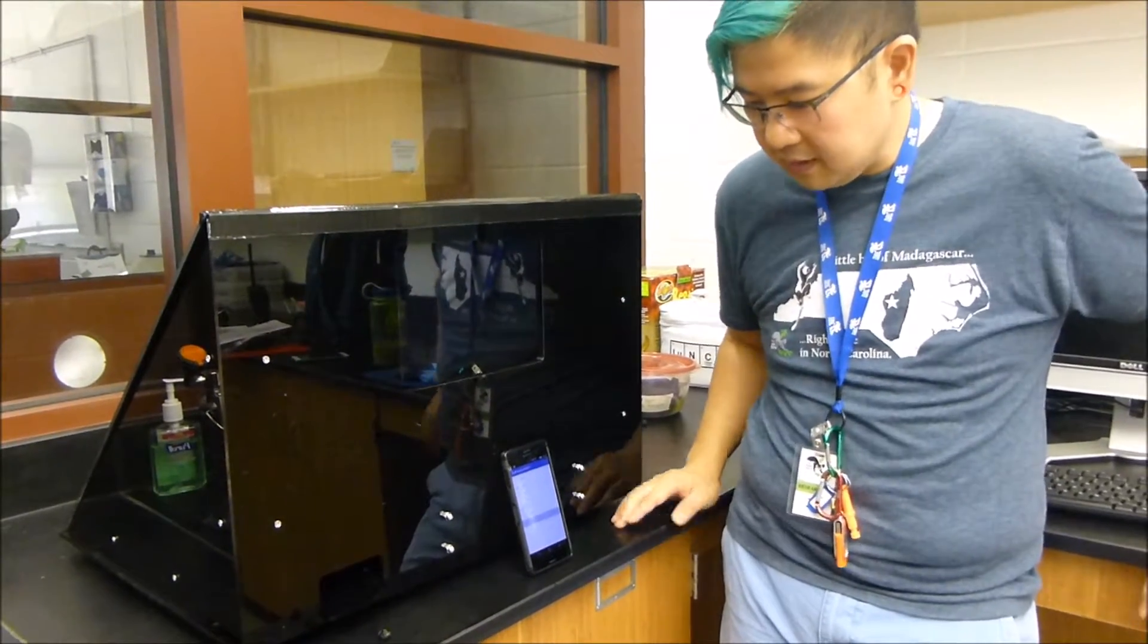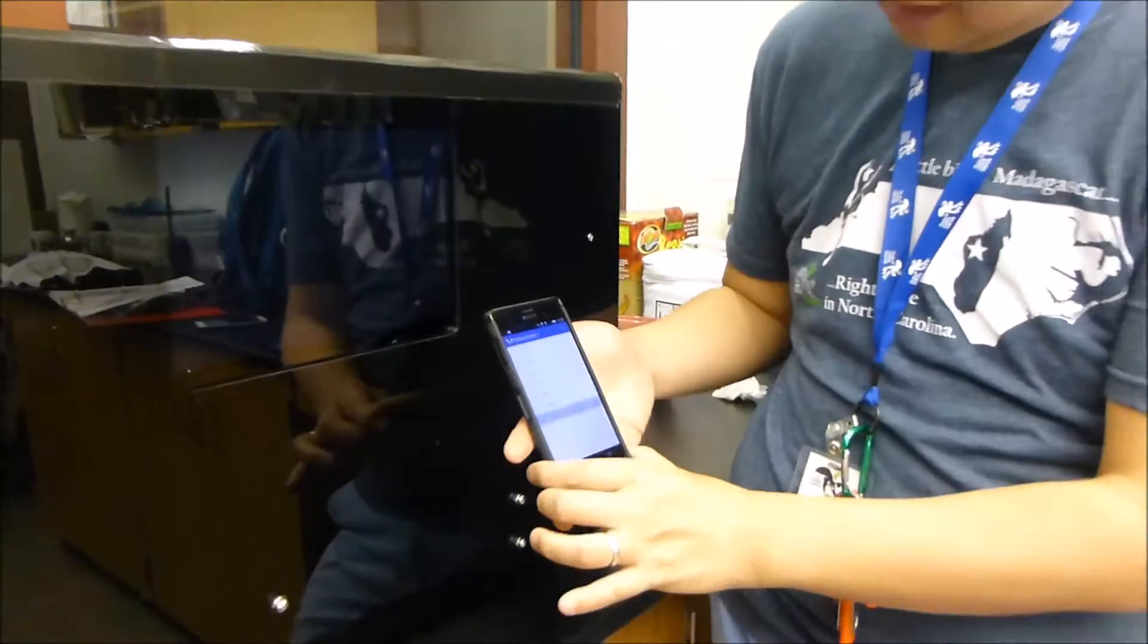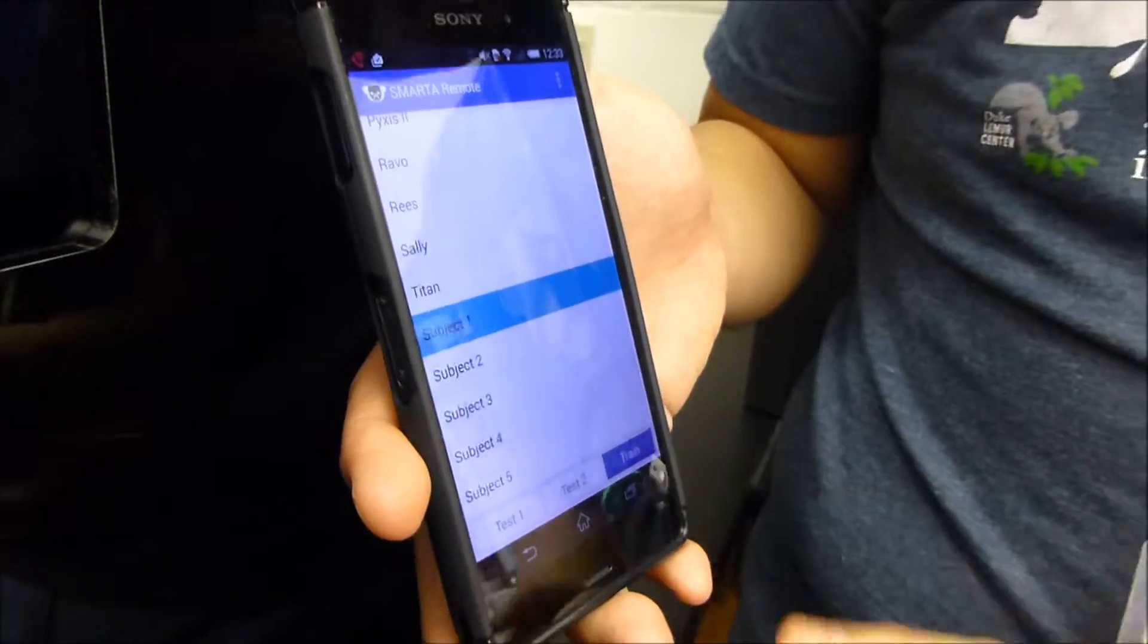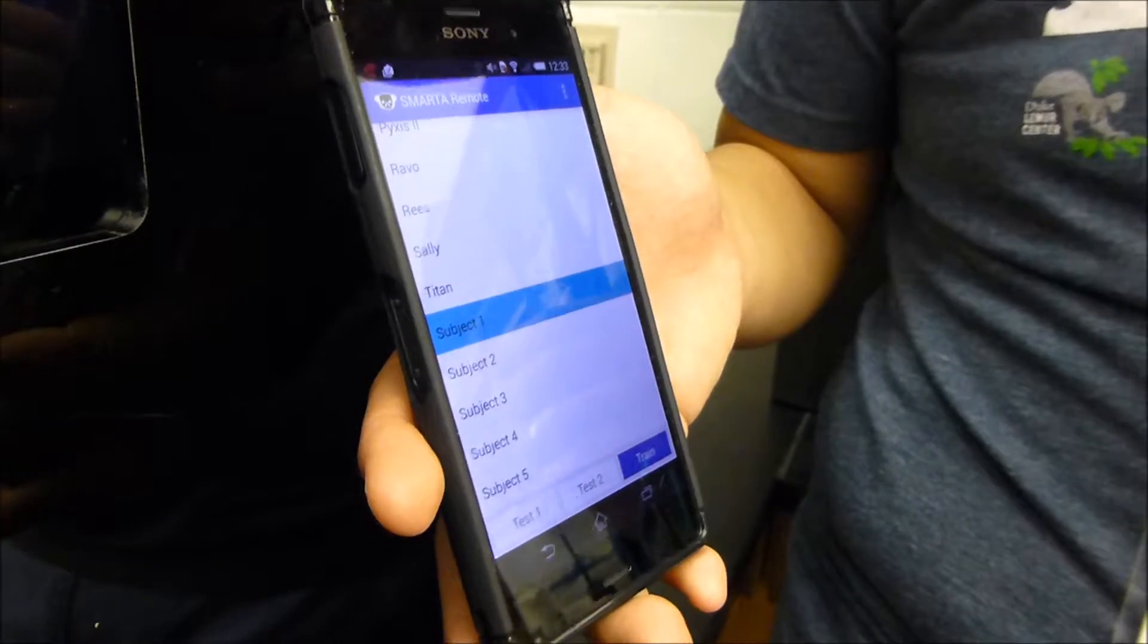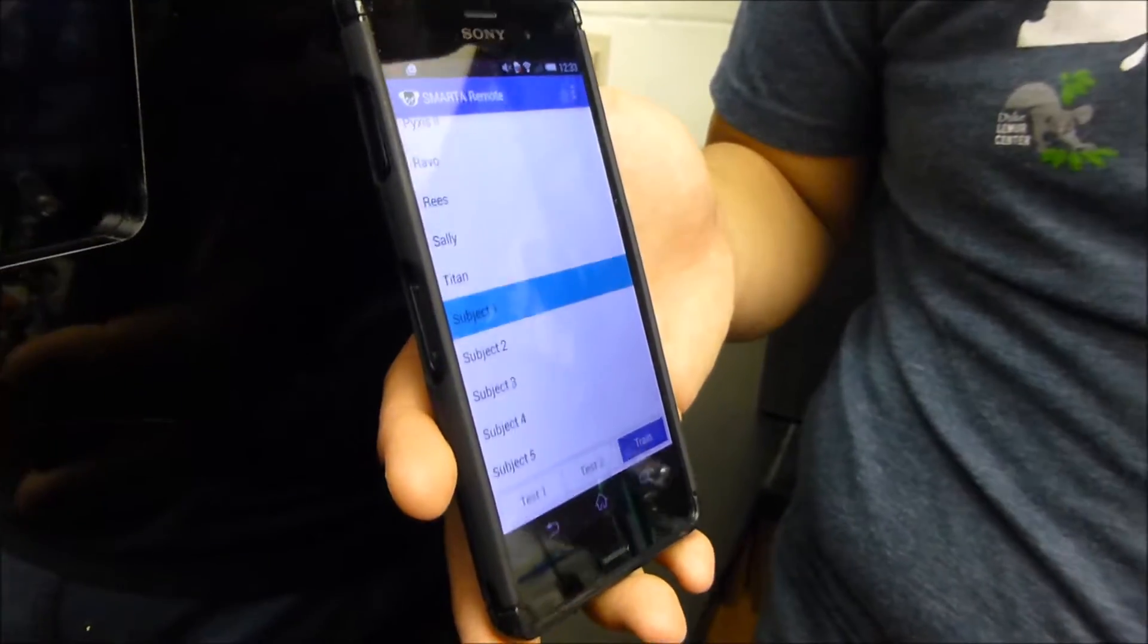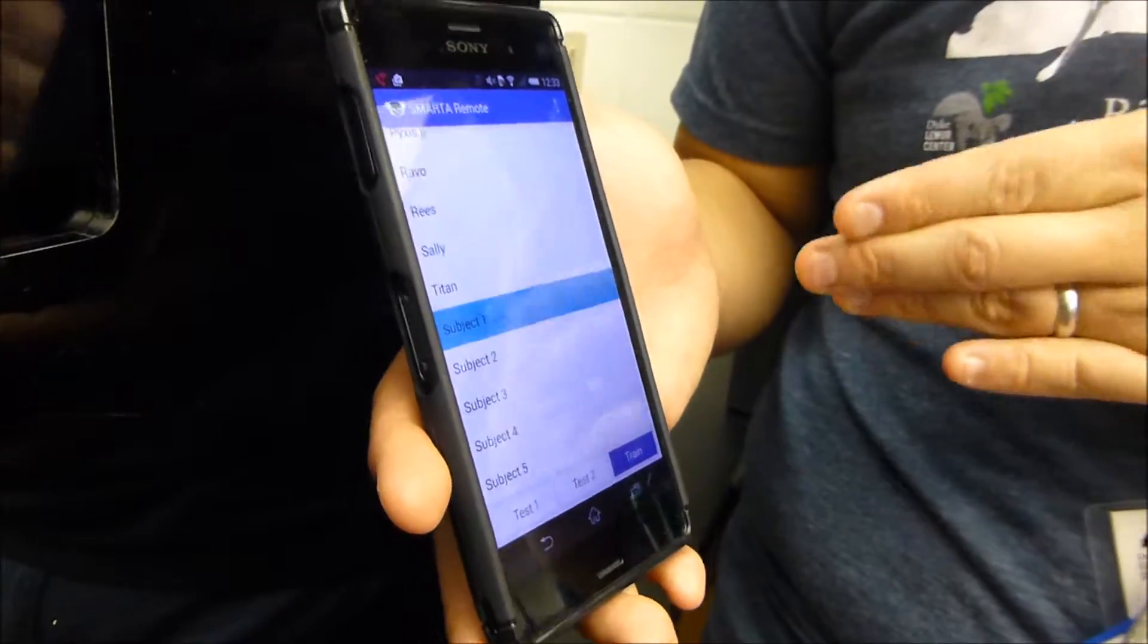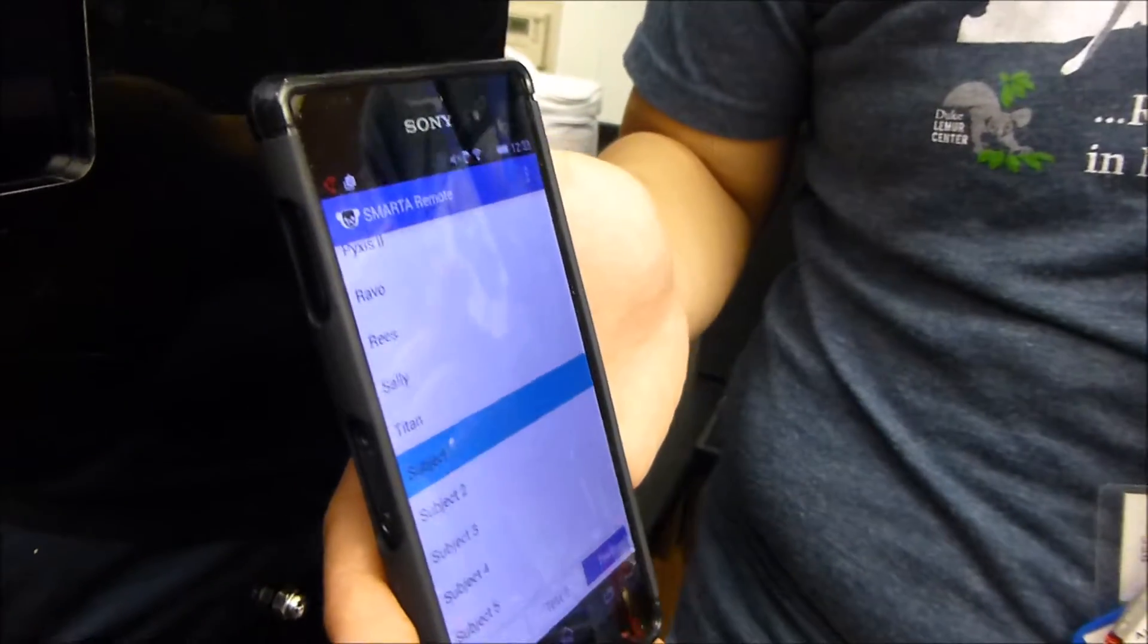All right, that's it. Once this is done, you want to hit the back button. You can hear the conveyor belt rewinding. And also the back button just tells the app that you're done with your session. It gathers all the data and uploads it online automatically.